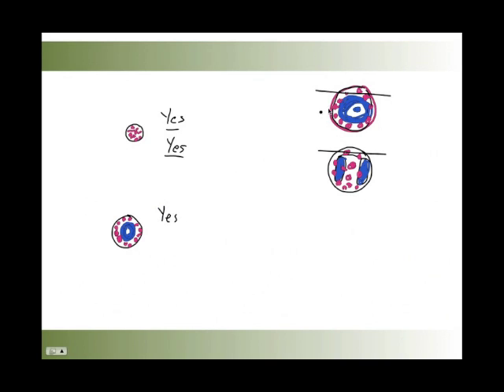Okay, an easy cut through, let's say, here. So we cleave off a little bit, but not the entire center of the nucleus. We would get something like this. All right, the harder question here, and the one that's going to blow your mind, is could this be an eosinophil? And the answer here again is yes. So something like this or something like this would also give us a profile of that. Somewhat smaller. And here it's fairly heterochromatic, but that could be because we're hitting the rim of the nuclear envelope or because we're going through an eosinophil. So in this case, it could be either.